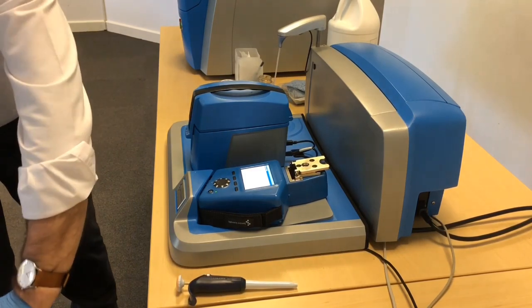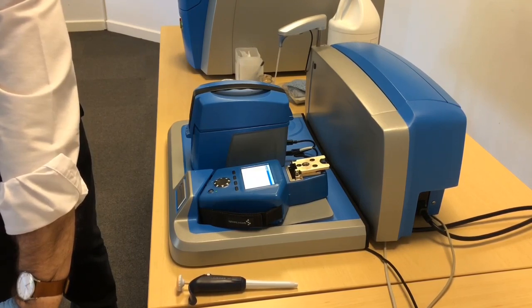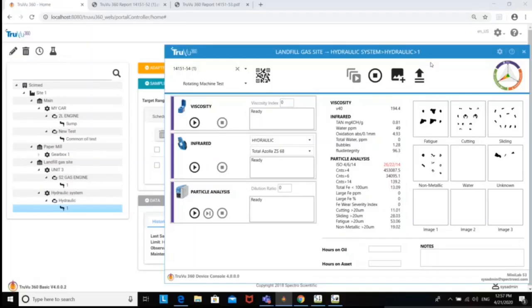So what I'll do now is upload this to the cloud with the upload button, and then we can look at the actual report in a bit more detail, but we'll switch to a view where you can see the screen. Okay, we've done the analysis. We're looking now, if you can see my pointer, at the device console screen. This is what the instrument operator will see. The sample that has just been measured, the instant data here, but there's no recommendations.